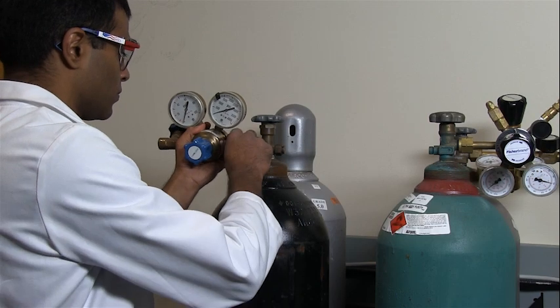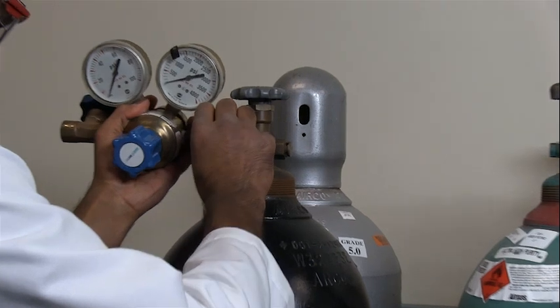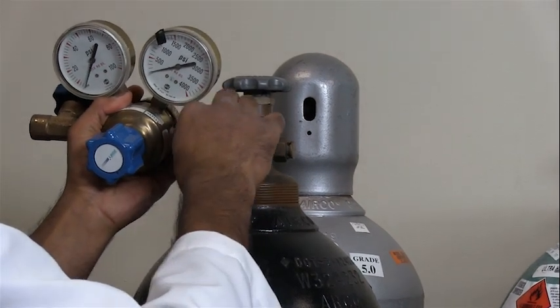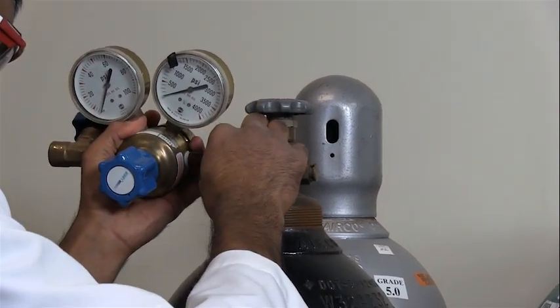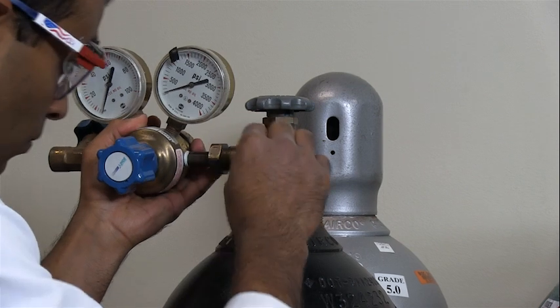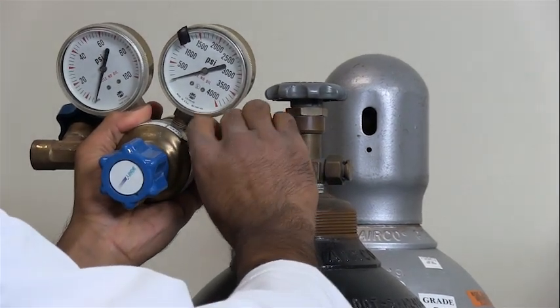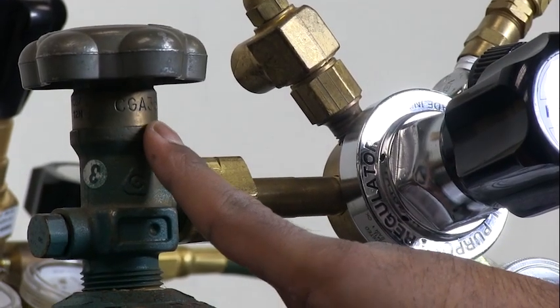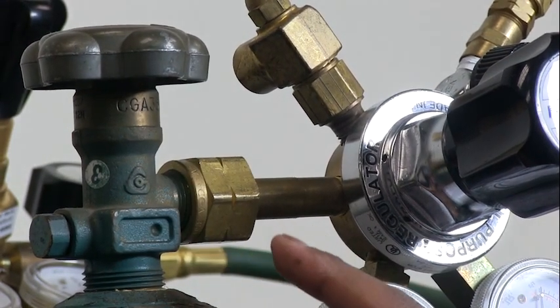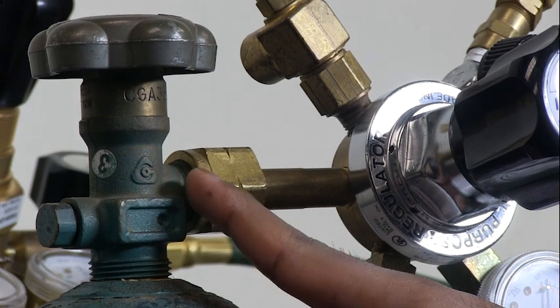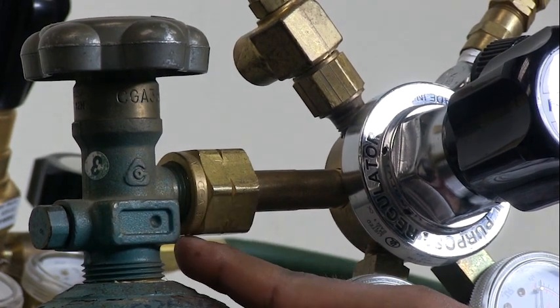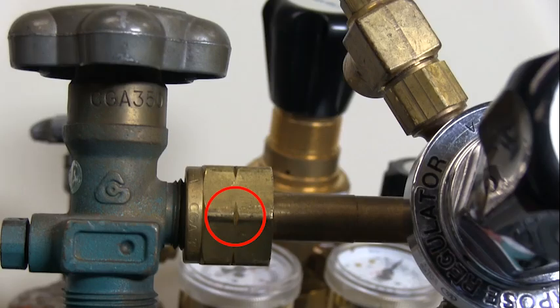Attach the regulator to the cylinder valve outlet. Never force the connection. If the inlet of the regulator does not fit the valve outlet easily, it may indicate the regulator is not intended for use with that gas. Always check for compatibility of equipment and materials before using any compressed gas. Left hand connections are used almost exclusively on flammable gas connections. Left handed connections have a notched groove in the surface.